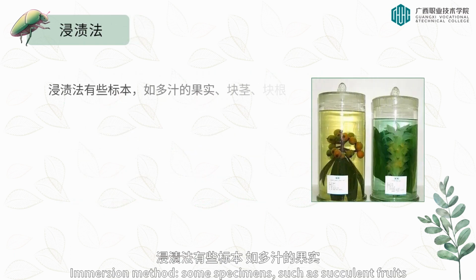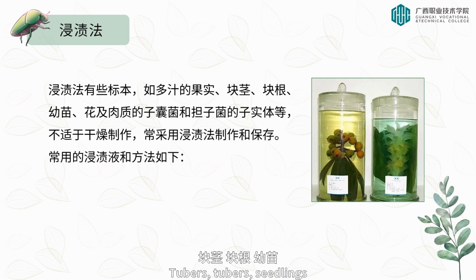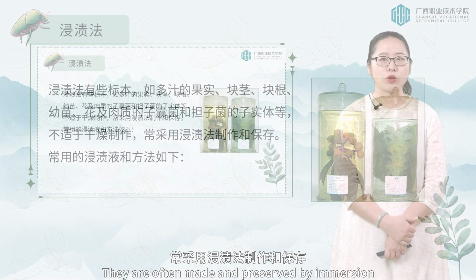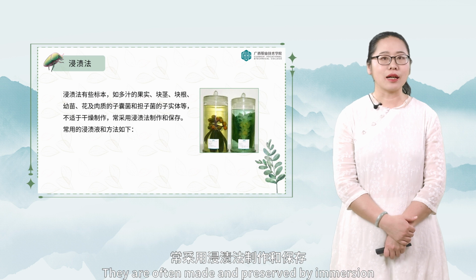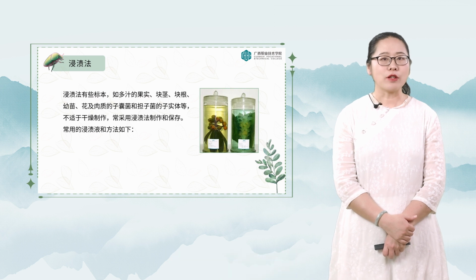Immersion method: some specimens such as succulent fruits, tubers, seedlings, flowers, and fleshy ascomycetes, and fruiting bodies of basidiomycetes are not suitable for dry production. They are often made and preserved by immersion. The commonly used immersion solution and methods are as follows.